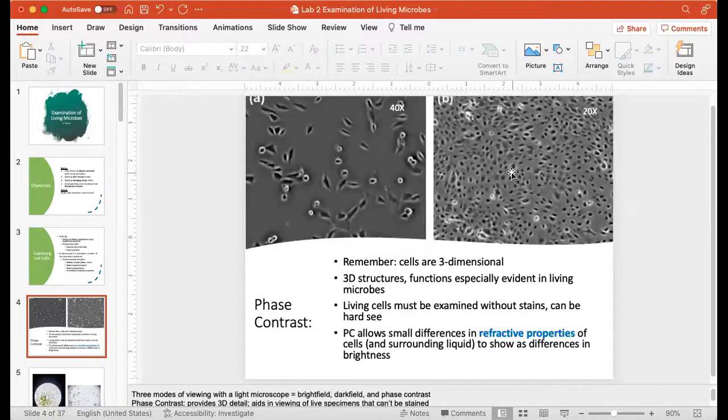These cells shown in black, all of these black structures in here, these cells are under the 20x lens. We cannot see bacteria under a 20x lens. I can see these cells. That tells me they're not bacteria. Under the 40x lens, these black cells are big. Not only can I see them, but they're big. That tells me they're not bacteria.